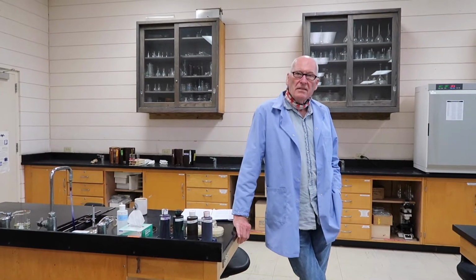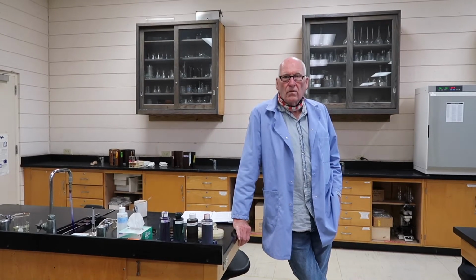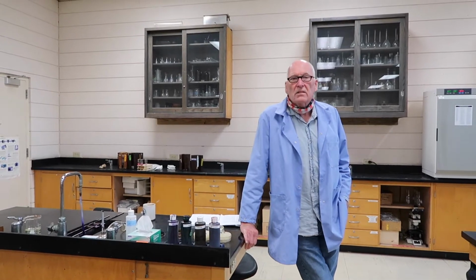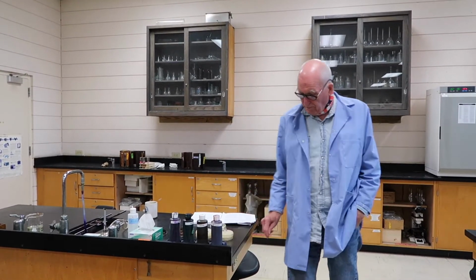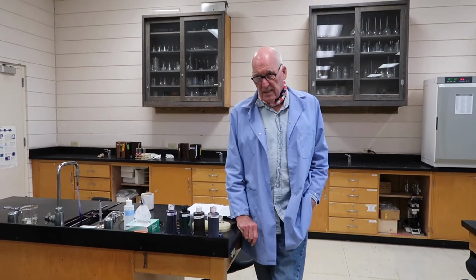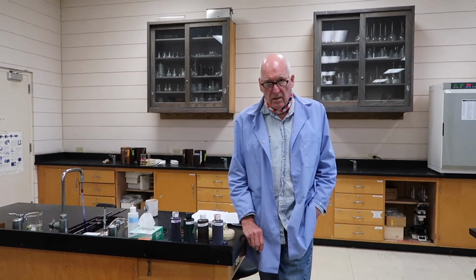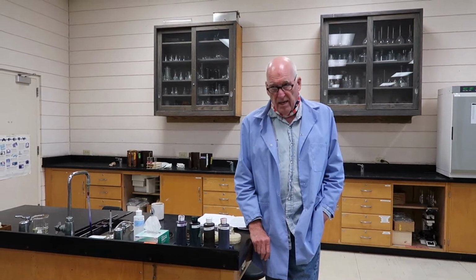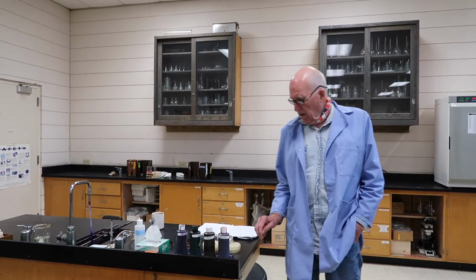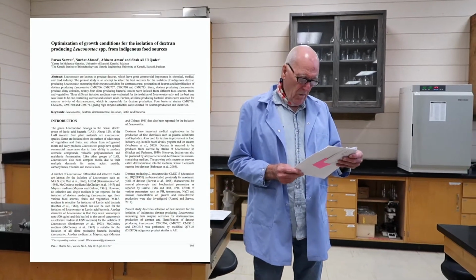Fall 2020. I just wanted to touch in with the class, and there's a couple things I want to point out about our sauerkraut fermentation project. As you know, we had the week off, so I went and tested T2. That's 2 days from when we set it up to start with, and then I ran 4 days, which I'm calling T4. Now, we sent you a paper, and I hope you got it.